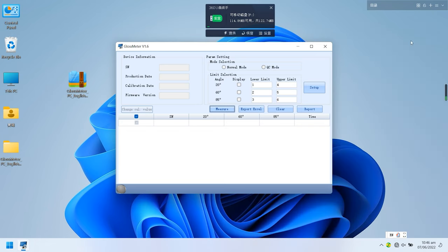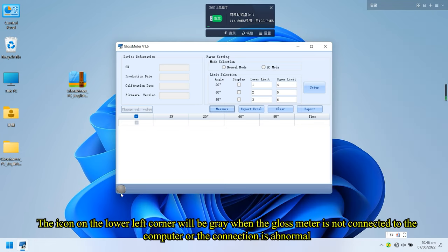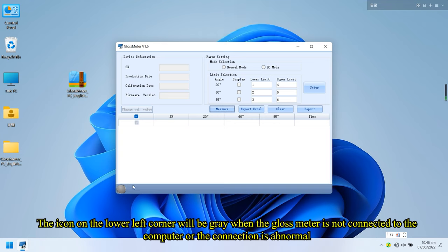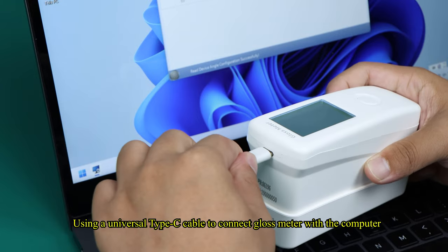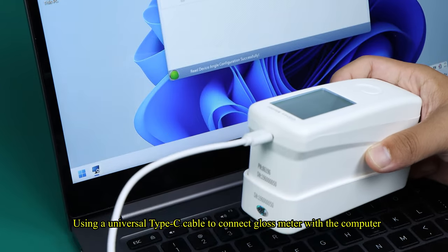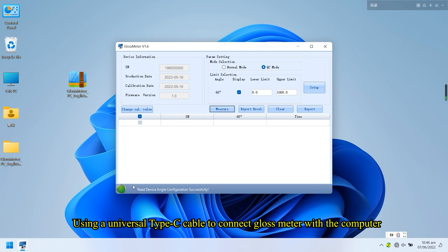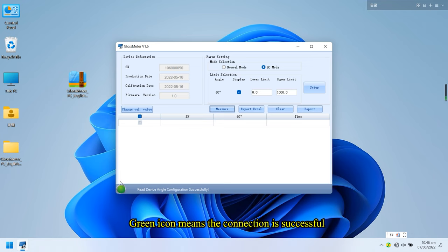The icon on the lower left corner will be gray when the gloss meter is not connected to the computer or the connection is abnormal. Using a universal type C cable to connect gloss meter with the computer, green icon means the connection is successful.